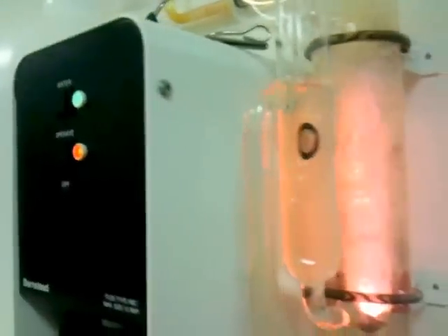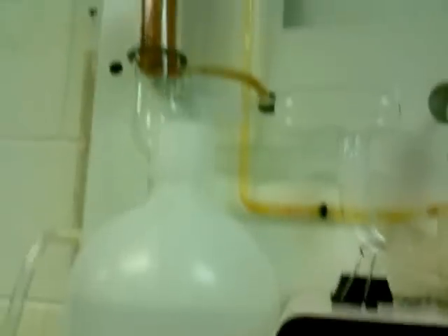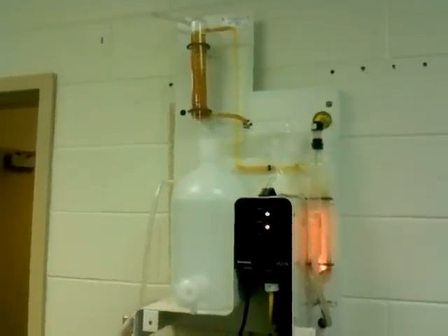This overflow line right here is just a check valve to make sure we don't get too much water in the system. It goes down, behind there, underneath, and then down to the drain. And this line is the original cold water line coming up into our system. So this is a little lab distiller to create distilled water.